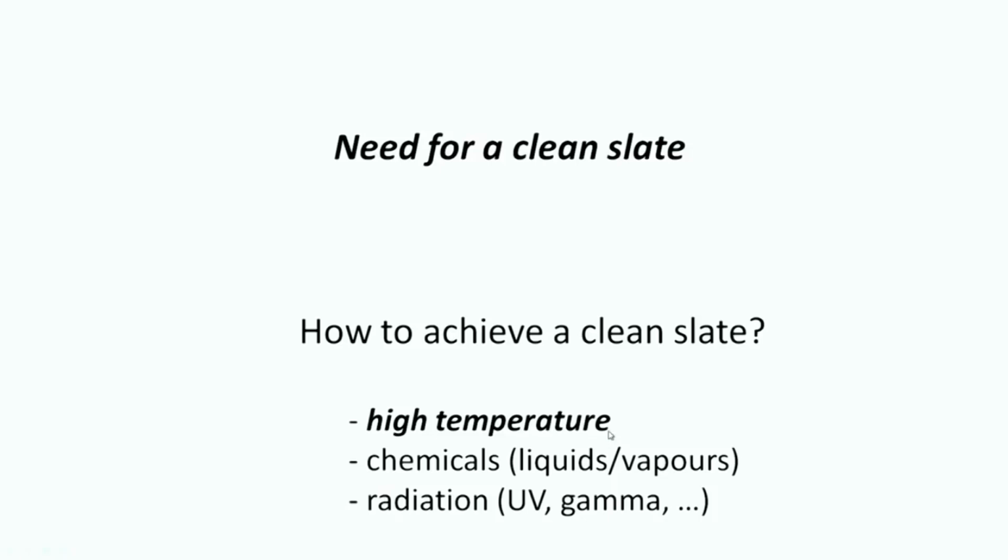So, let us move further in this lecture from this point. We will look at high temperature in some details of achieving a clean slate, or sterilization as it is called, using high temperature.